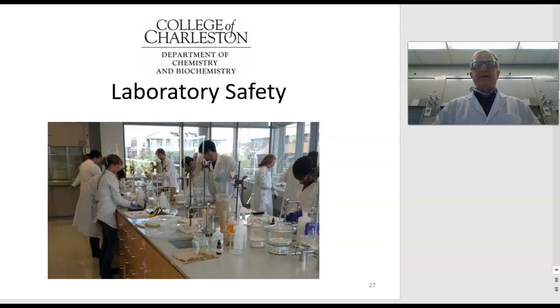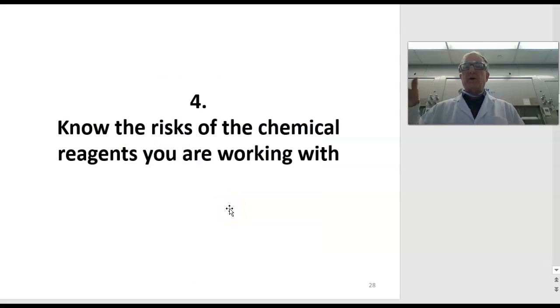Hello, Dr. Devac, and we're talking about lab safety. In this video, we're going to talk about understanding the risks of the chemical reagents that you're working with. How do we find out about those reagents? There are going to be two ways. One is the labels, and the other is by using SDSs, safety data sheets.